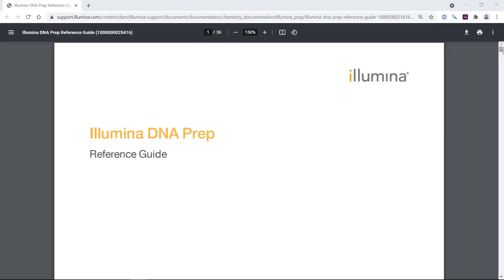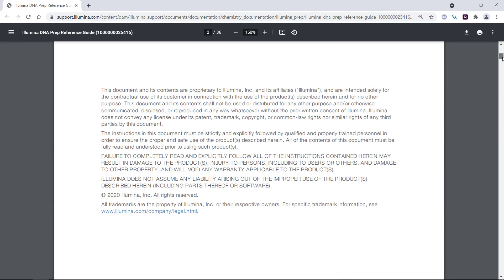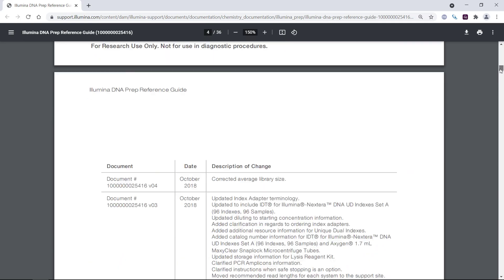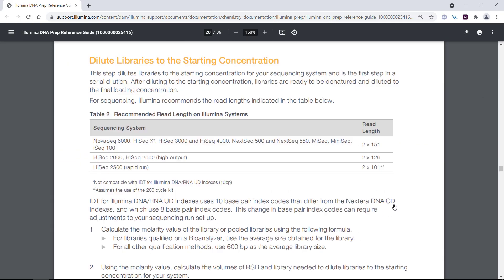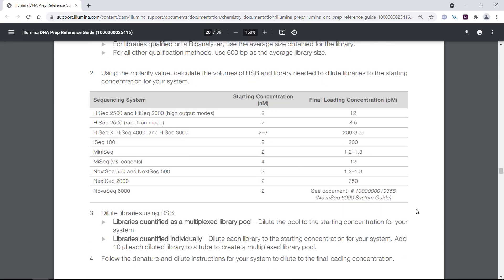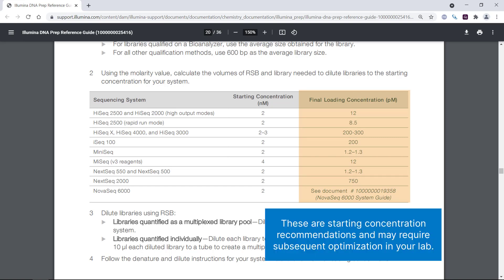Here I'm looking at the Illumina DNA Prep Reference Guide, and I'll navigate to the Dilute Libraries to the Starting Concentration section. We can see a table with recommended final library loading concentrations for different Illumina platforms. These are starting concentration recommendations and may require subsequent optimization in your lab.